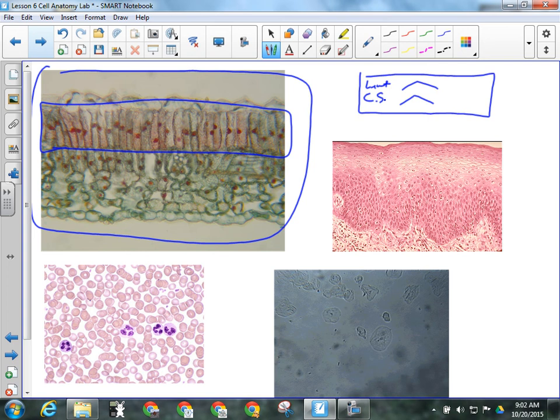Okay, second cell you're going to look at is the animal cell. And on the slide, it's going to say stratified squamous epithelium, which is a really technical term for when you dust your knuckles, that red skin that hurts like crazy underneath. Okay, so if you skin yourself, right, and underneath is that red layer of skin, that's your stratified squamous epithelium. It's the underlayer of your skin.